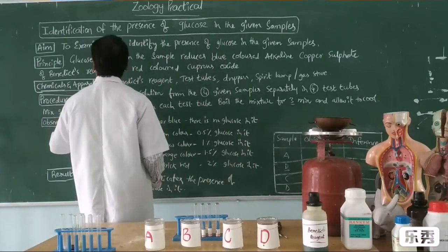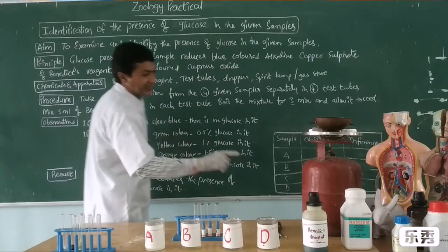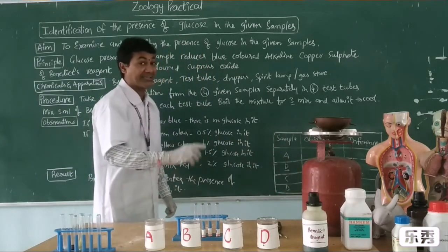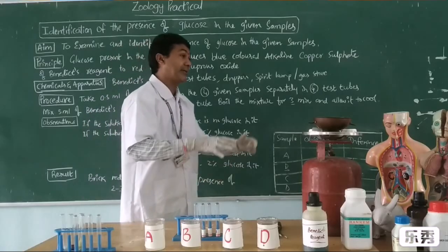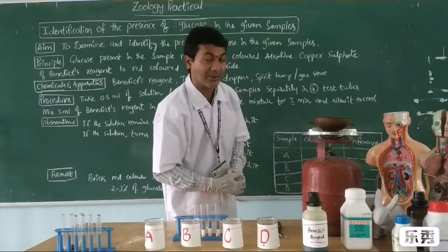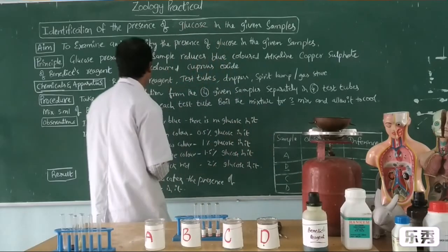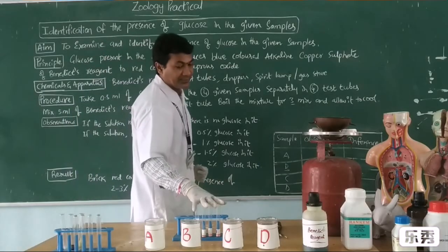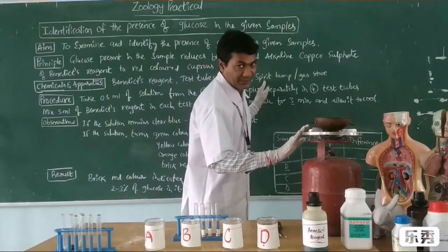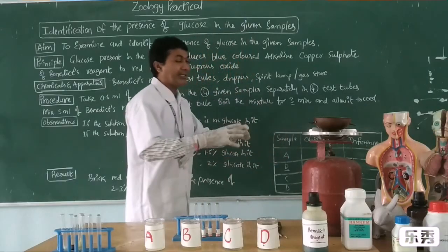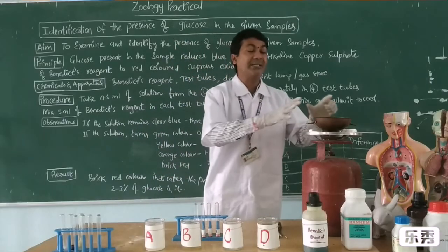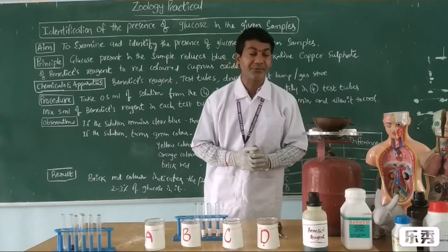Chemicals and apparatus: we have Benedict reagent — we call it Benedict qualitative reagent because it not only identifies glucose but also determines what percent of glucose is present. We also have four test tubes, droppers, and a spirit lamp. We need to heat the test tubes. After adding the Benedict solution, these four test tubes are heated on a water bath.